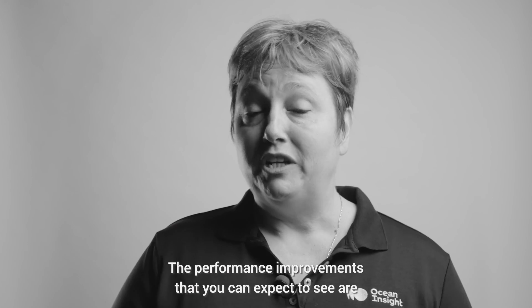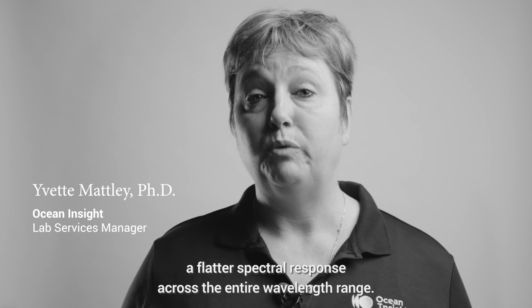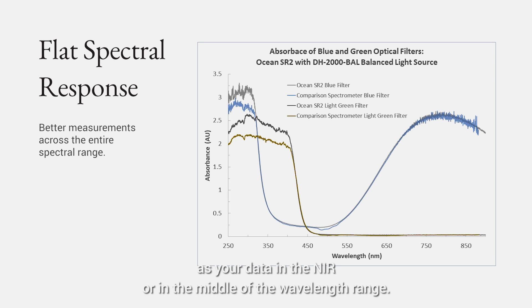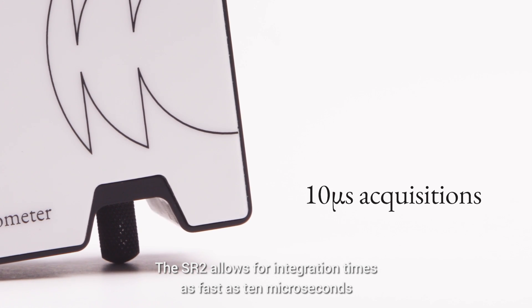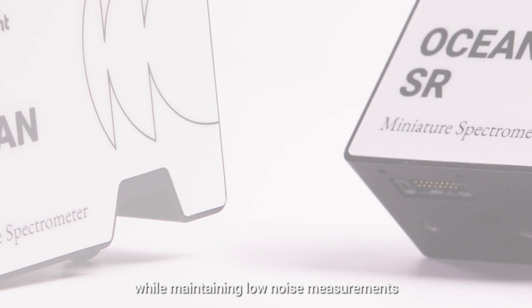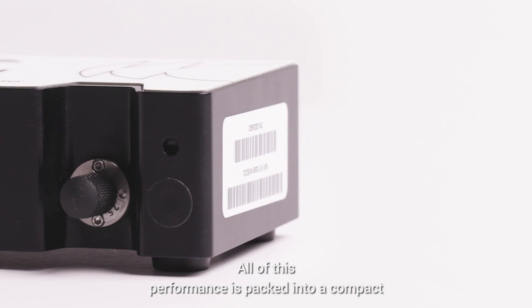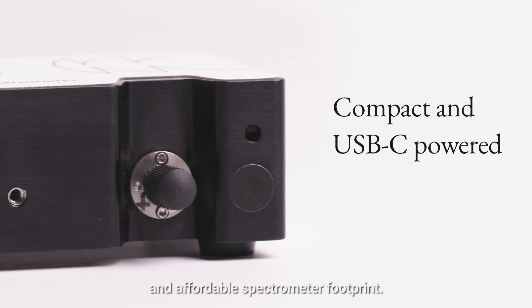The performance improvements you can expect to see are a flatter spectral response across the entire wavelength range, meaning your data in the UV will be just as good as your data in the NIR or in the middle of the wavelength range. The SR2 allows for integration times as fast as 10 microseconds while maintaining low noise measurements and a signal-to-noise ratio of 380 to 1. All of this performance is packed into a compact and affordable spectrometer footprint.